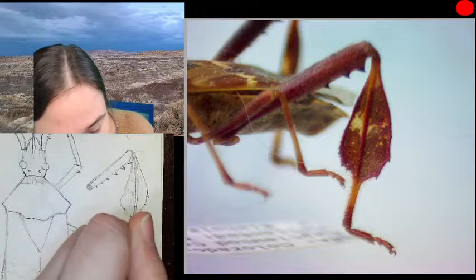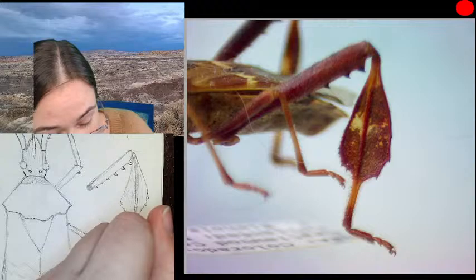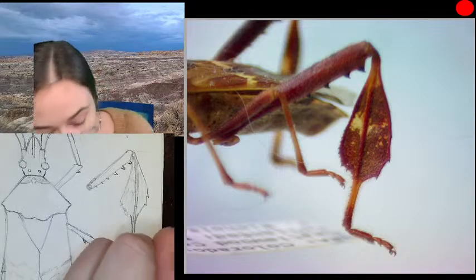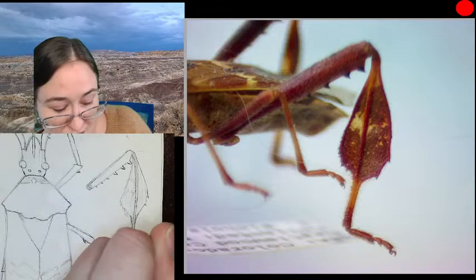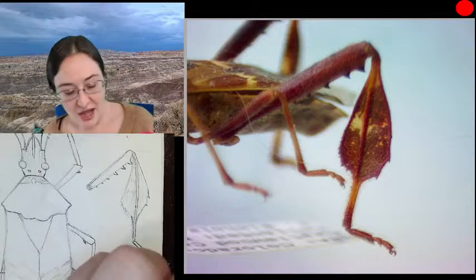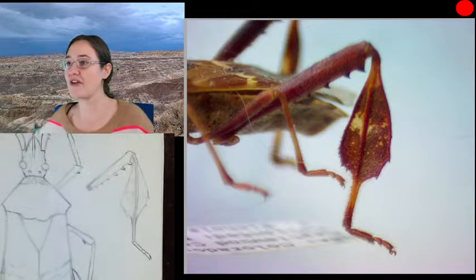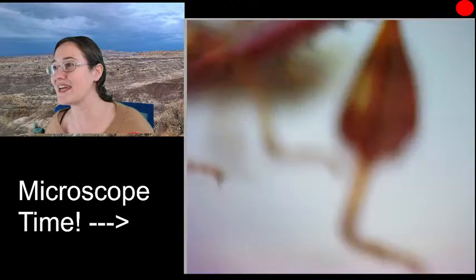And it looks like our little tarsal segments have a lot of hair on them. And those hairs are a lot of times to help them climb and hold on to things. It helps with friction, essentially. So, if we zoomed in really far on these little toes, we probably could see huge tufts of hairs that are almost like brooms.